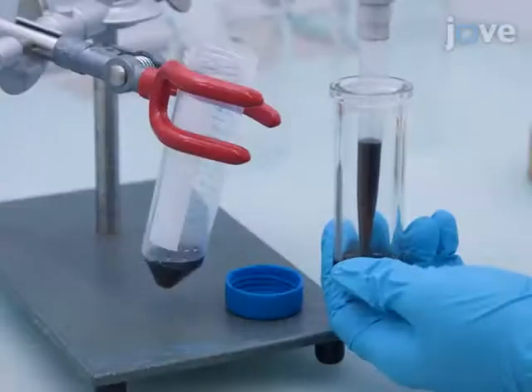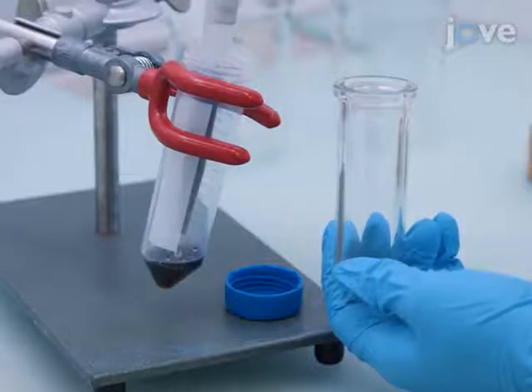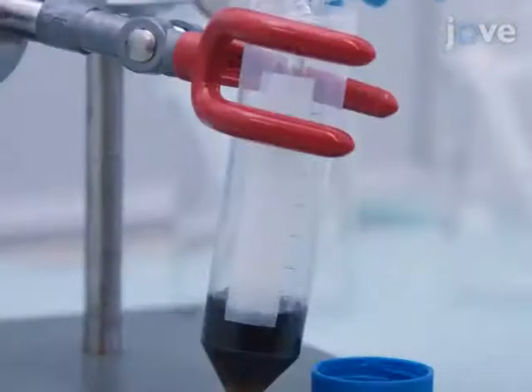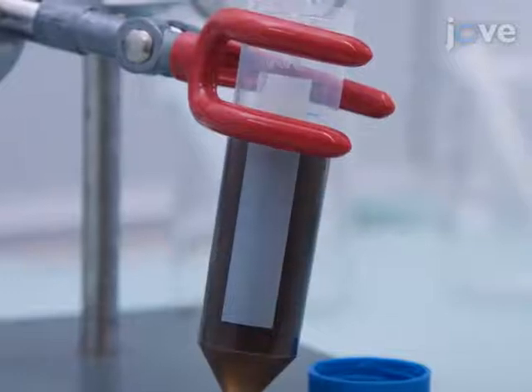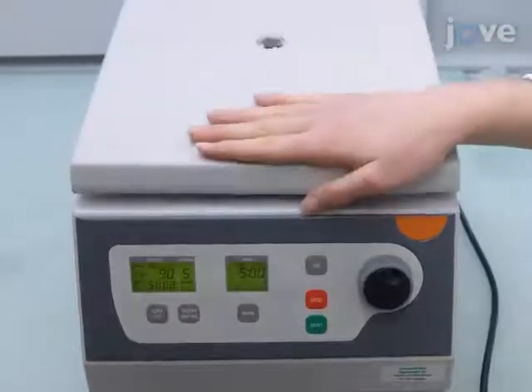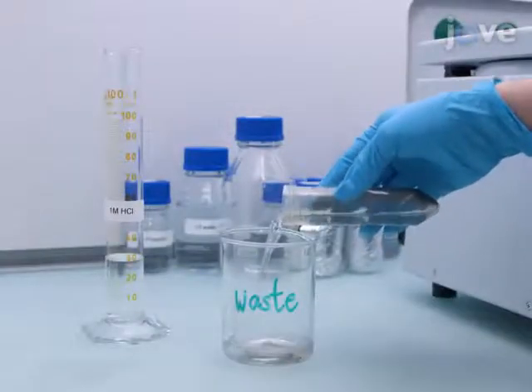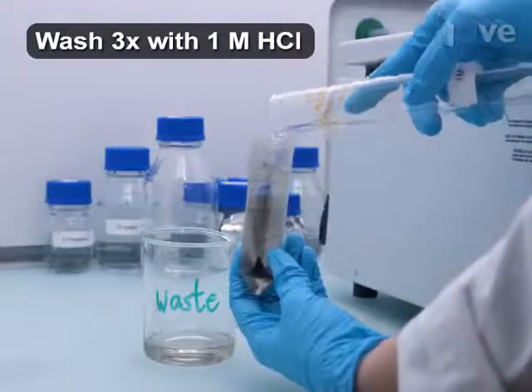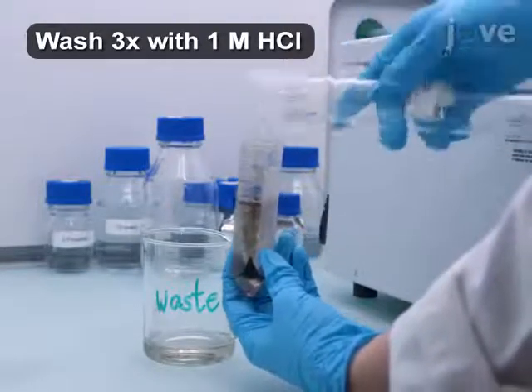Transfer 7.3 milliliters of the resulting colloidal platinum nanoparticle suspension to a centrifuge tube. Precipitate the 2 nanometer platinum nanoparticles with 30 milliliters of 1 molar hydrochloric acid. Centrifuge the mixture at 2900 times G for 5 minutes and discard the supernatant. Repeat the centrifugation in hydrochloric acid and removal of the supernatant twice more to finish washing the nanoparticles.